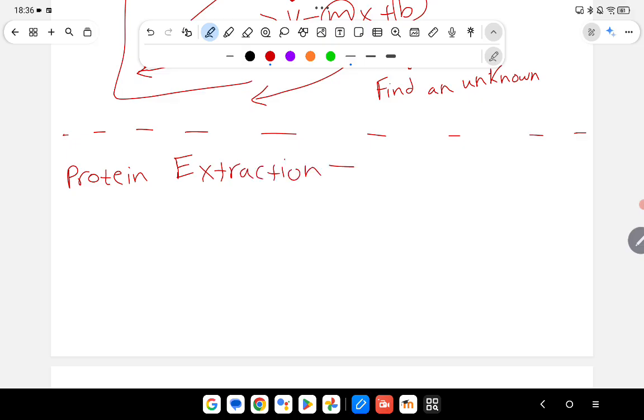Okay, so you remember that short lab where you just put the fish muscle in the Laemmli buffer, and then we were just going to wait for it to break down, and then the next two labs we did the Western blot and gel electrophoresis, and then we did immunodetection. Okay, so for protein extraction, some concepts I want to home in on.